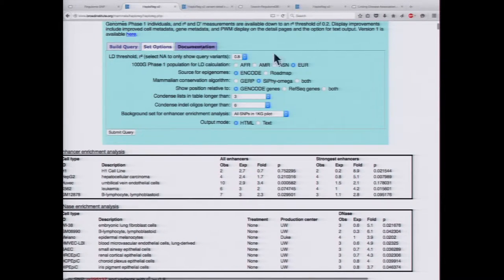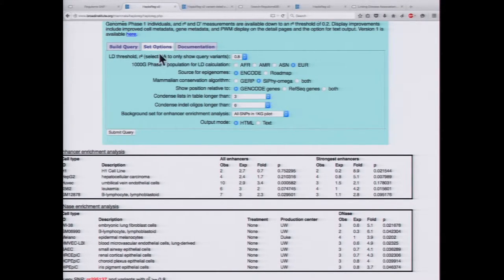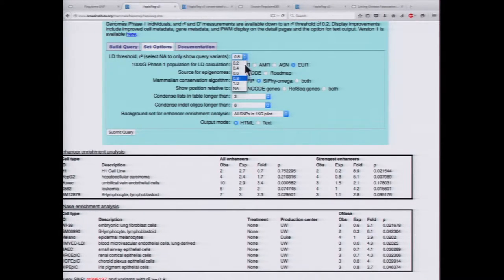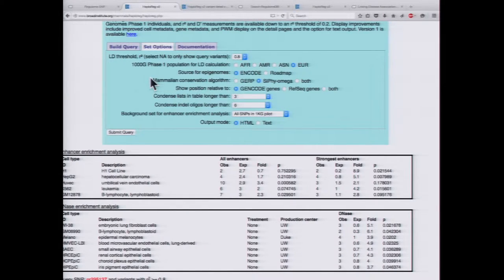One important aspect of HaploReg is making sure you're running with the correct options. There are quite a few options to consider. One is the LD threshold — the R-squared value, which can range from 0.2 all the way to 1; if you choose the non-applicable option, you're just searching for the SNP itself with no LD. What's actually really vital is choosing the correct population for your LD calculation. By default it's set to the European population, but for example, if you're looking at results from a GWAS in a Chinese population, you want to click the Asian population.